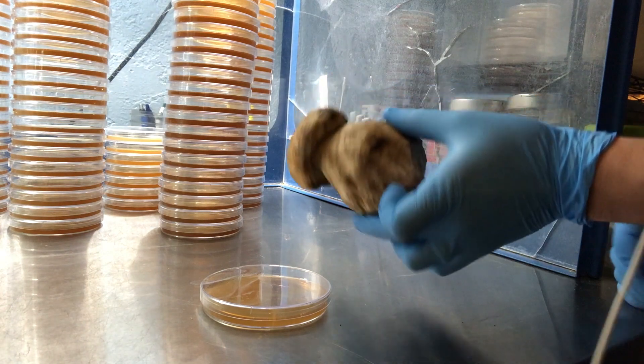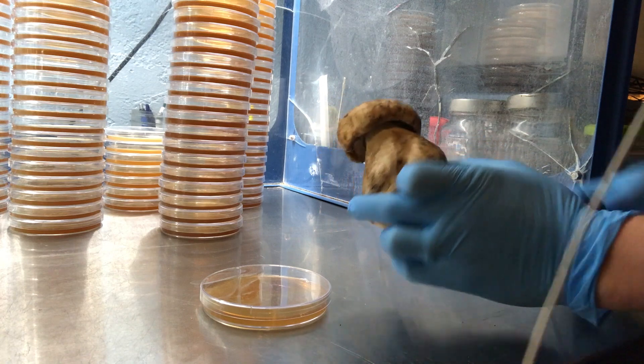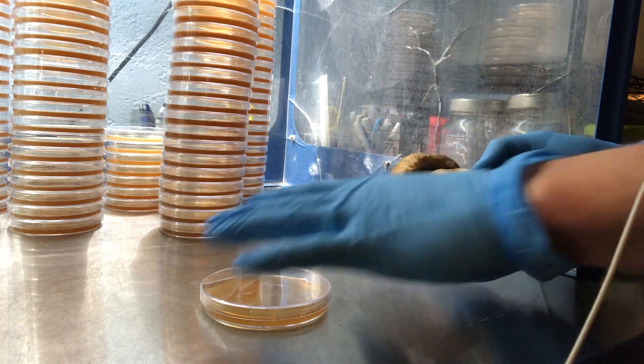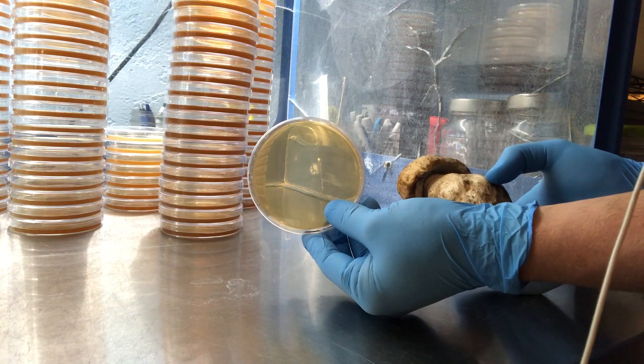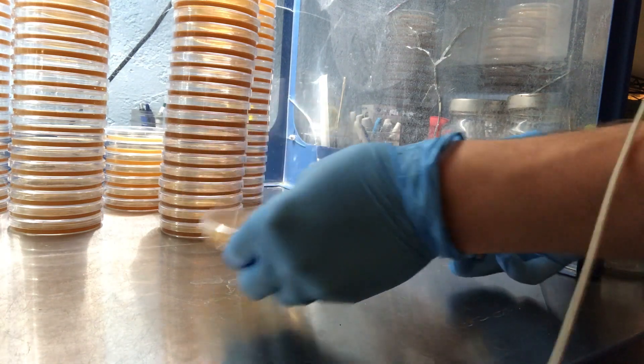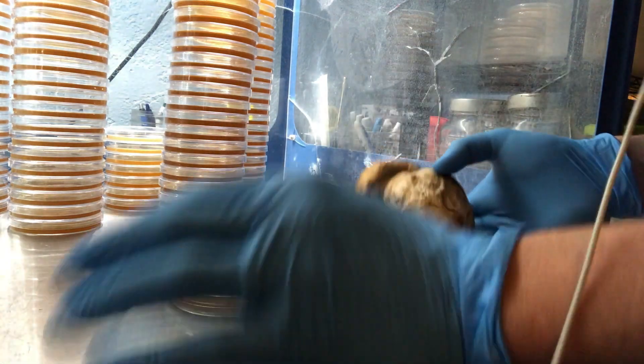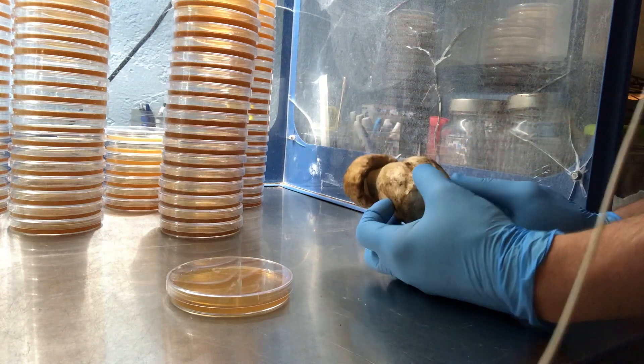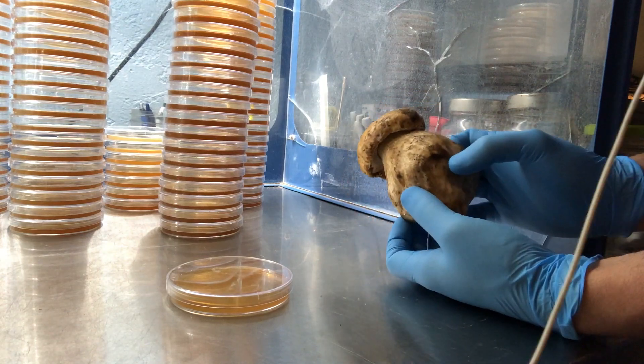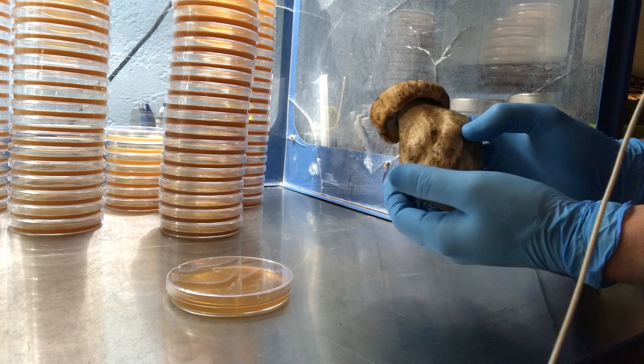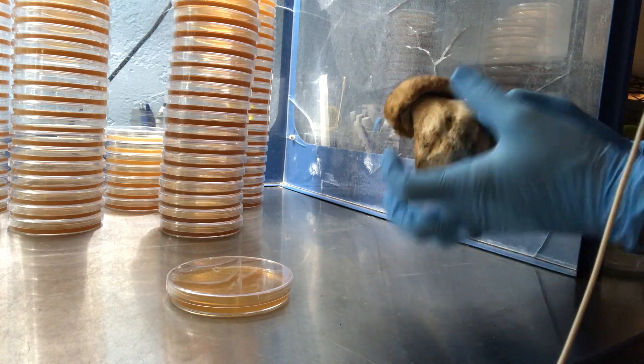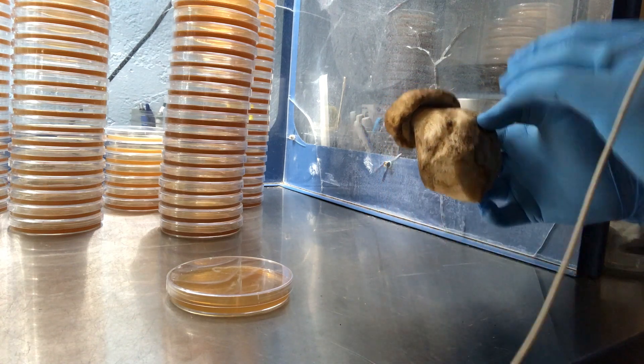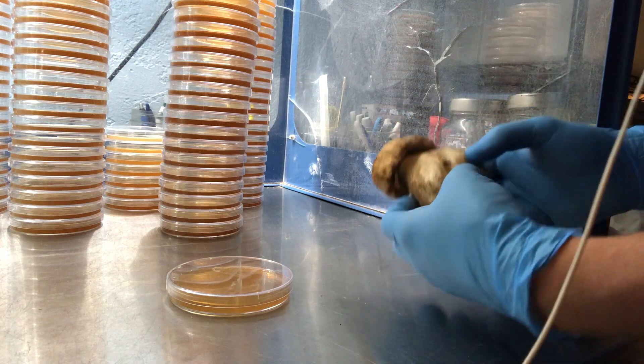Alright, okay guys, so I've got our porcini or Boletus edulis in the flow hood here and I'm going to be cloning onto an MEA plate, malt extract agar. The key thing to cloning a wild mushroom, or any mushroom for that matter, is that you don't want to introduce any contamination from the outside of the mushroom. So the best way to do this is to break it apart very carefully.